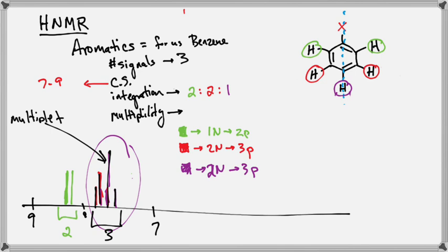Why is it ugly though? Well, because the purple hydrogen and the red hydrogen are so chemically identical that my instrument couldn't differentiate them, which means it's overlapping signals and I see a multiplet. What do I see? A multiplet with 3. It makes perfect sense. So the multiplet isn't something that you just ignore theoretically. It's something that you look at when you get to a structure. You can now prove why it's an ugly mess.